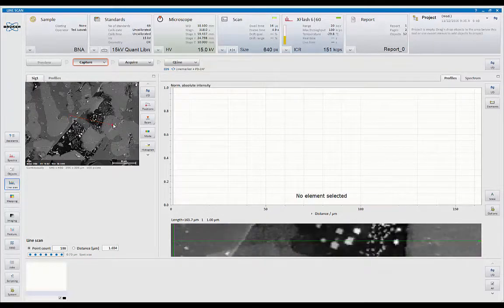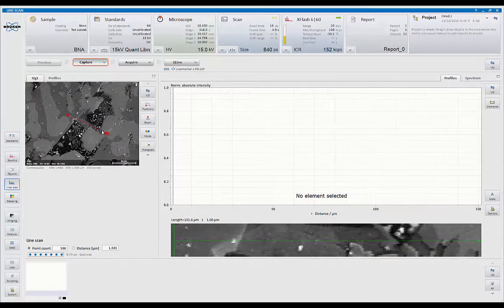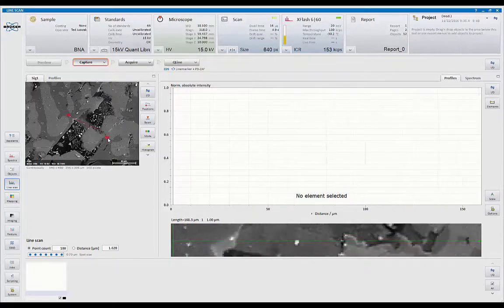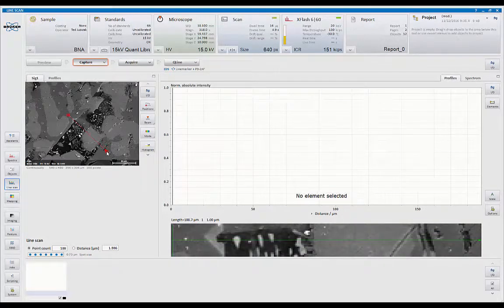So let me pick up that end. There we go. So that's the region. So that's the zoomed up area down here, showing me exactly the region. So if you wish to tweak or optimize it for a particular area, you can do it that way as well. Or just look at it zoomed up over here.